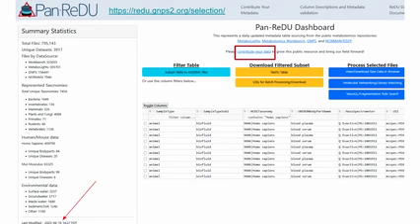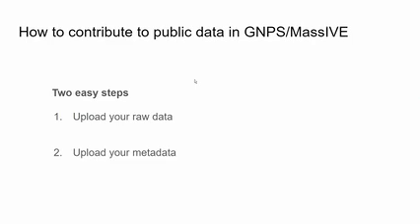Direct upload capability to your platform. Great question. That will be the next few slides. Yes, so there are different repositories. I'm going to talk now mostly about GNPS MassIVE, because that is ours. There are also others. I will also refer to them later again, and it doesn't really matter where you upload your data. I will just show you how to do it in GNPS MassIVE now, and this will just be a very, very quick walkthrough.